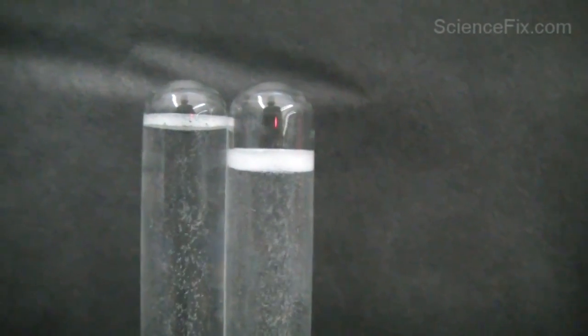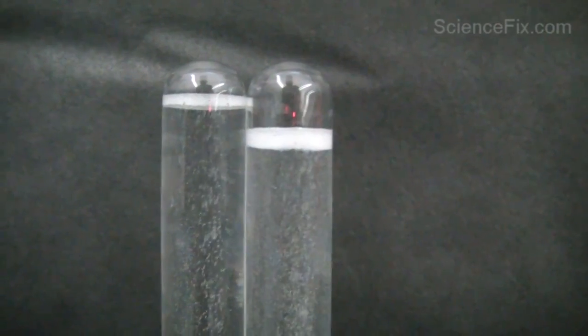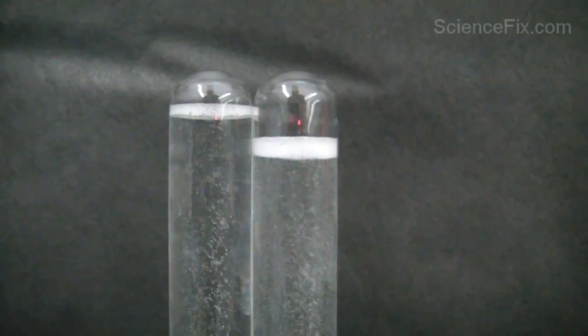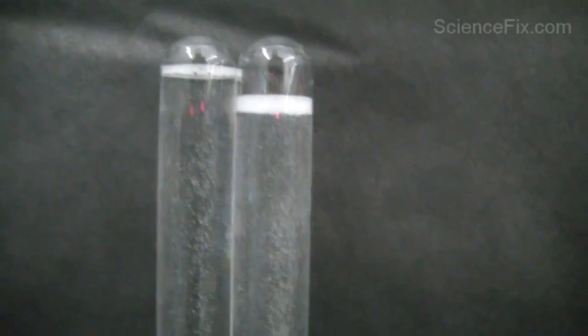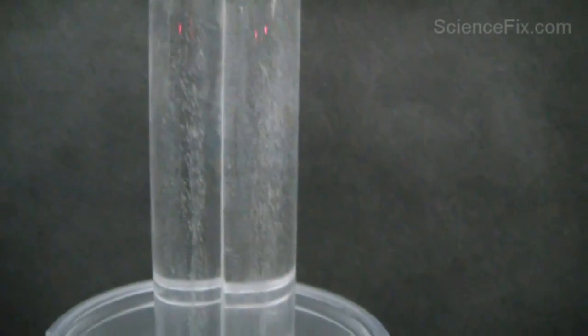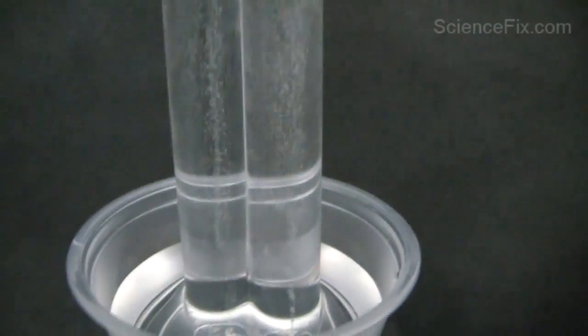You can see in the right test tube you have twice as much hydrogen gas as oxygen gas. This is how experimenters first learned that the ratio of hydrogen atoms to oxygen atoms in water is two to one - it's a two to one ratio, thus H2O.